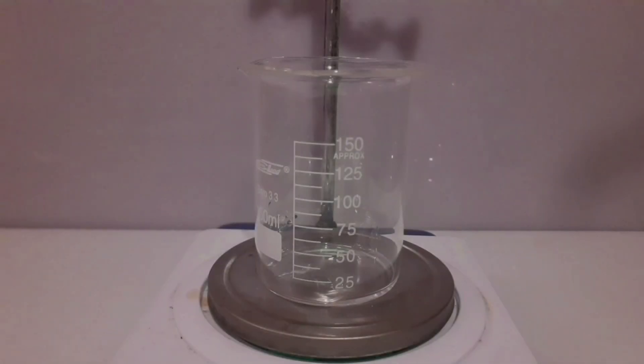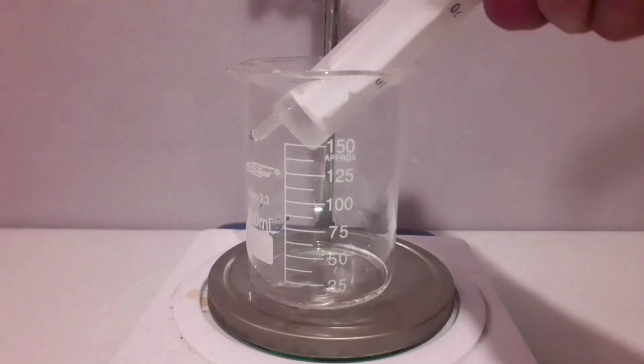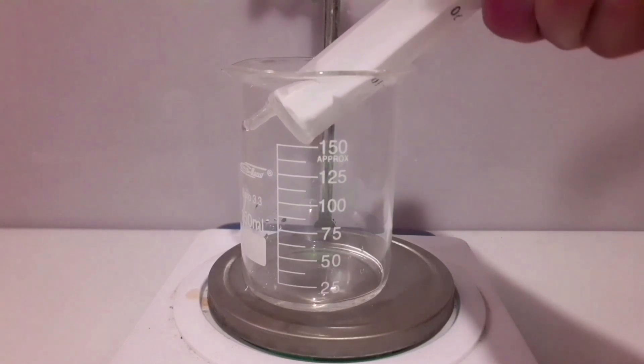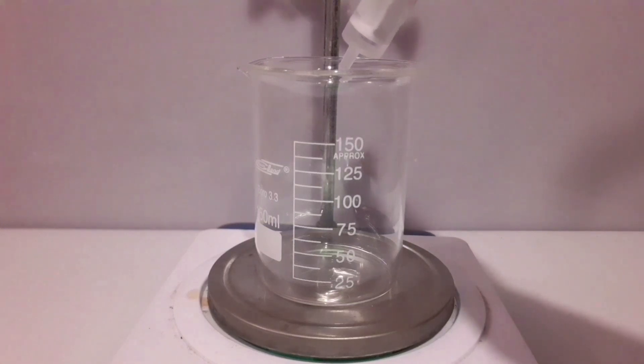Dissolve platinum in aqua regia. In order to prepare aqua regia you need to mix hydrochloric acid and nitric acid in a molar ratio of 3 to 1. So you need to do some maths to figure that out.